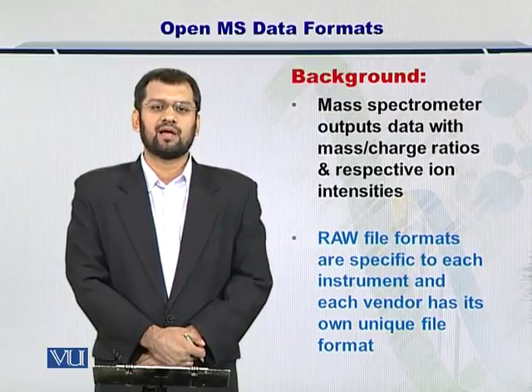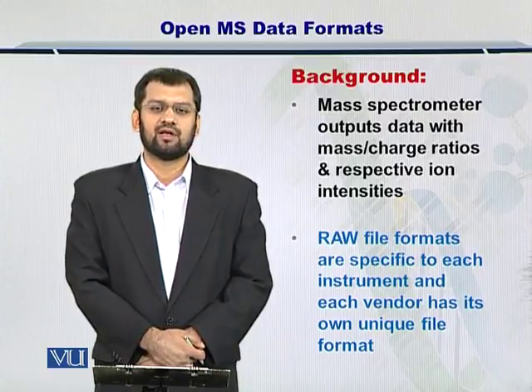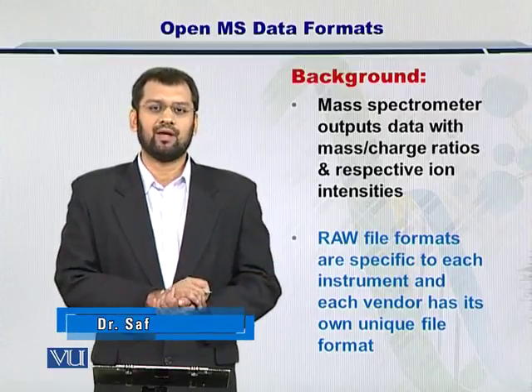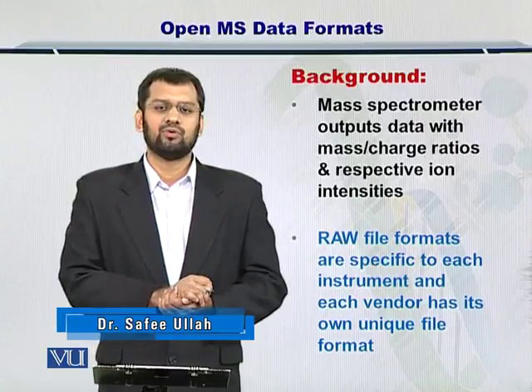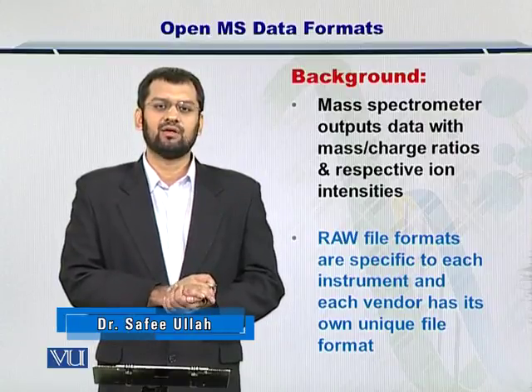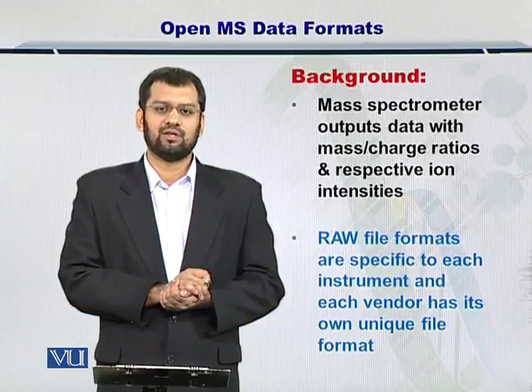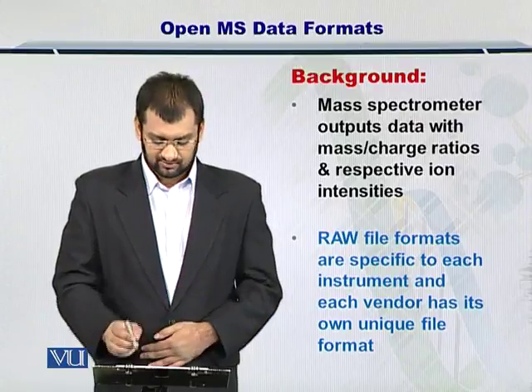Now, there are multiple types of mass spectrometer instruments out there in the market, and each one of them has its own raw file format. In order for you to be able to process this data, you need to have some standard file format, and therefore the need for open file formats.